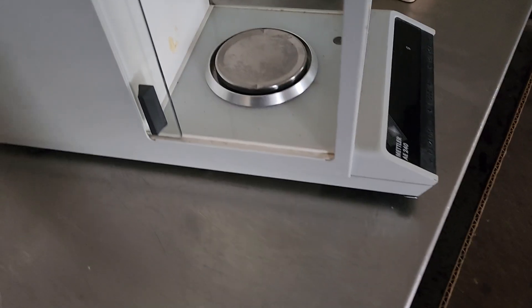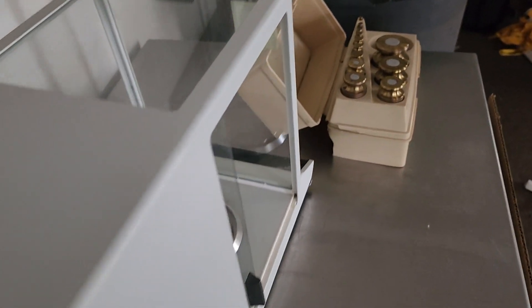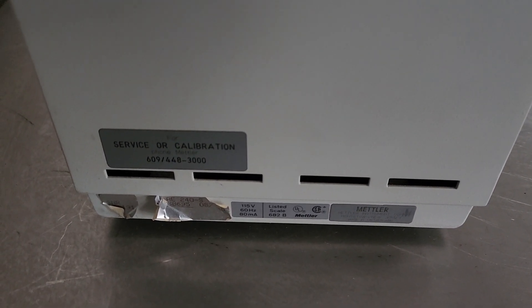That's the unit. If you've got any questions or concerns, let me know. This takes a standard D-plug, by the way. Standard D-plug. That's it. Thank you.